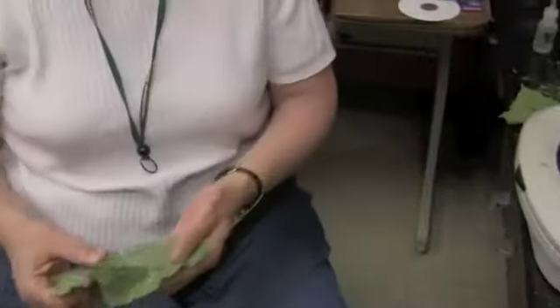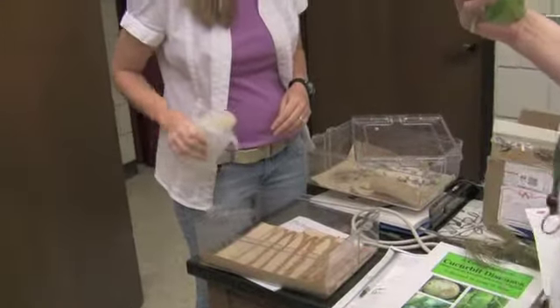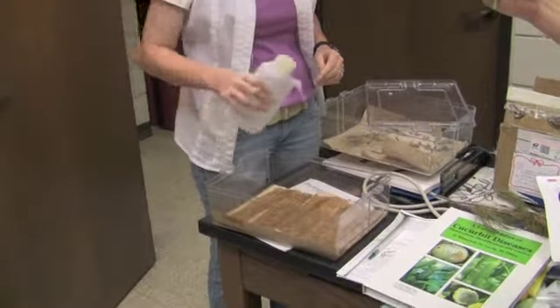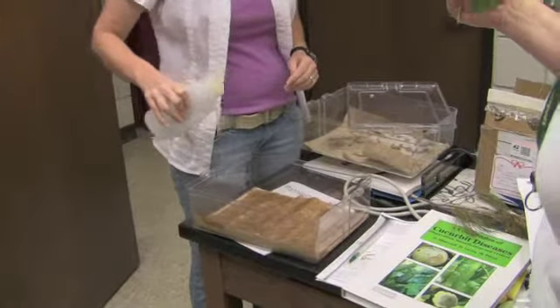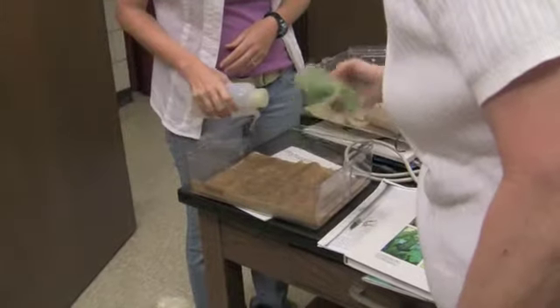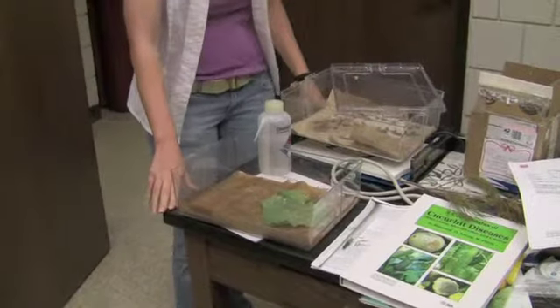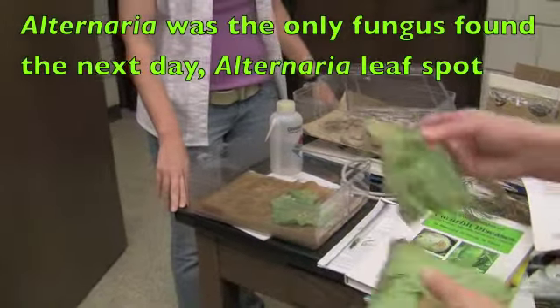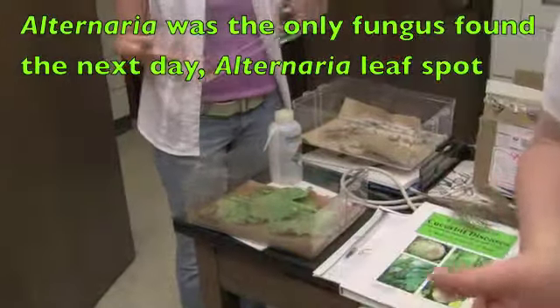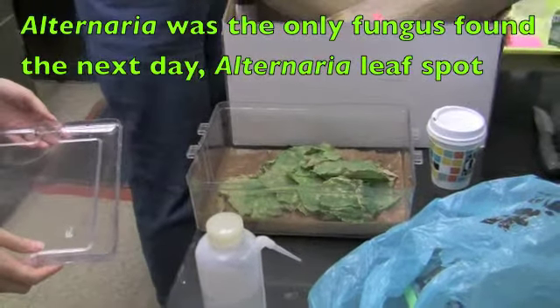And over here, we've dampened a paper towel, or are dampening a paper towel, and we'll lay some leaves on this. And we don't want it too wet or the leaves will rot quickly. So what we'll do is lay some leaves in here, both right side up and upside down. Re-examine them again tomorrow and see what has developed.